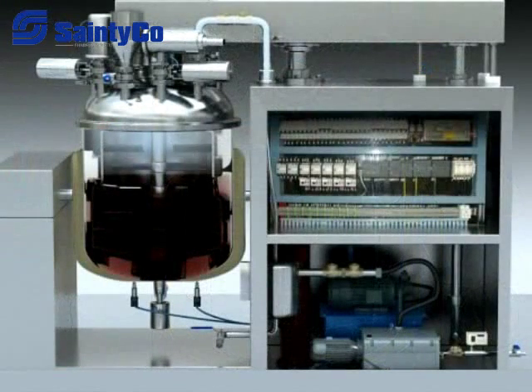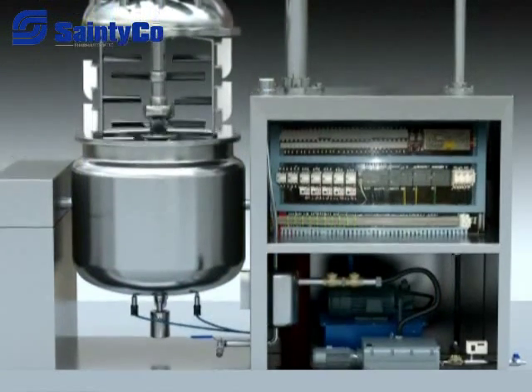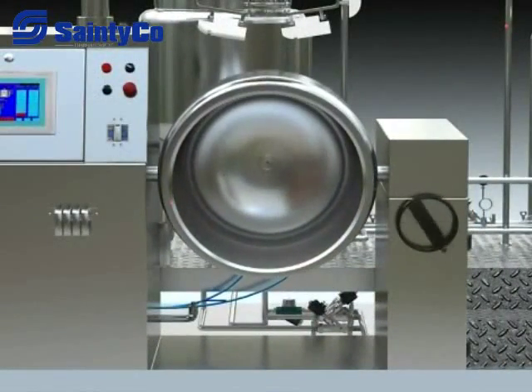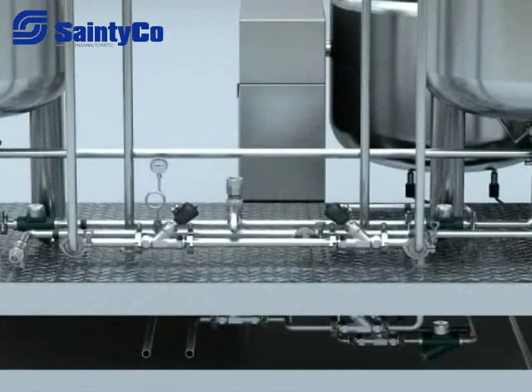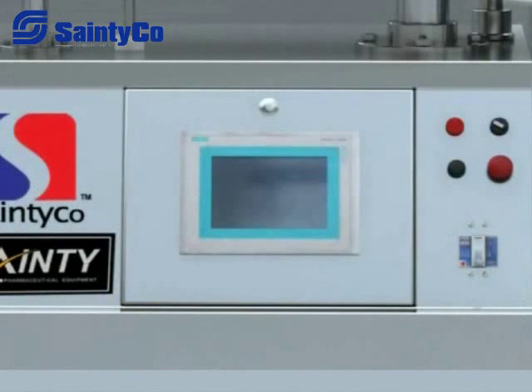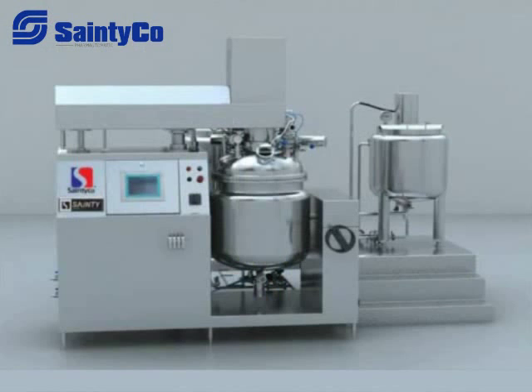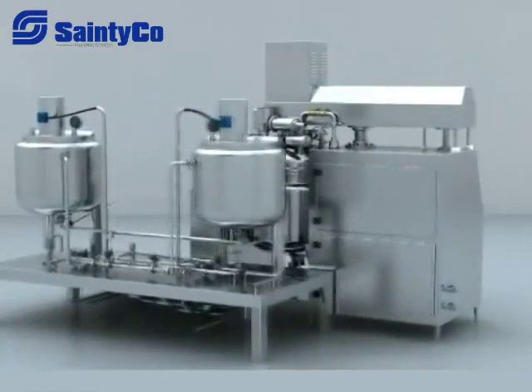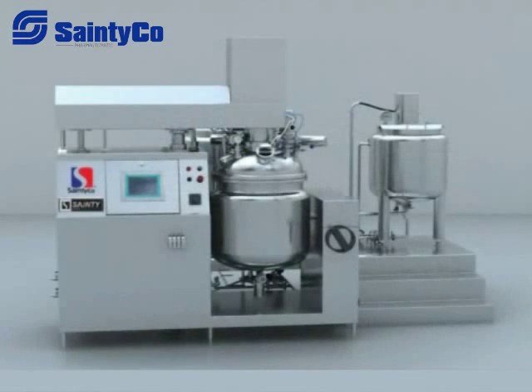The machine is made up of a pre-treatment tank, vacuum emulsification blending tank, vacuum pump, hydraulic system, pouring out system, electro control system, and workable platform. The material is made from SUS316L material, and the mirror-finished inside surface is 300 mesh.